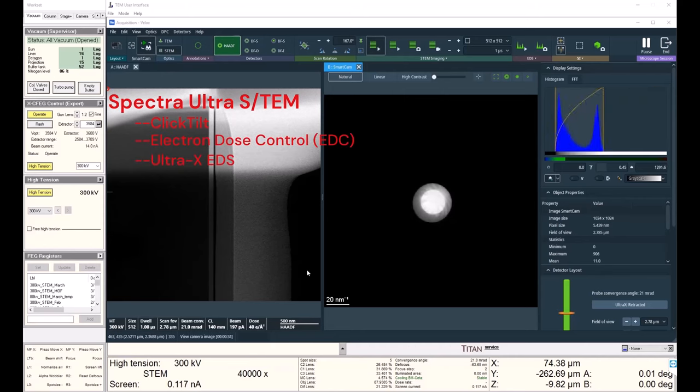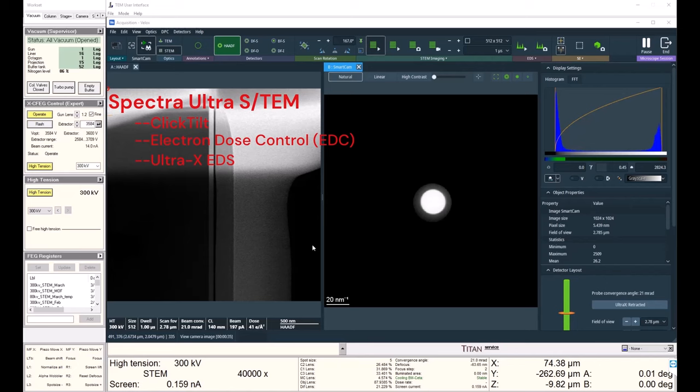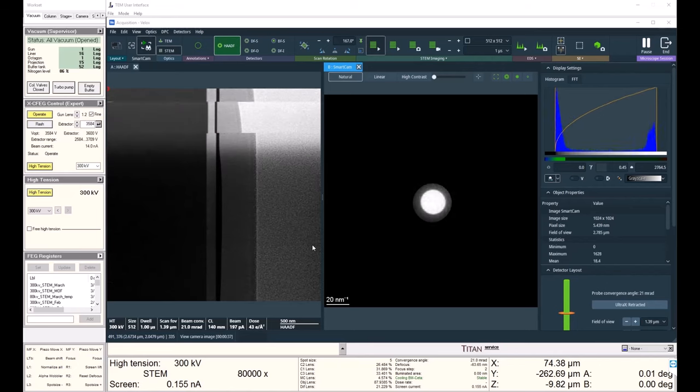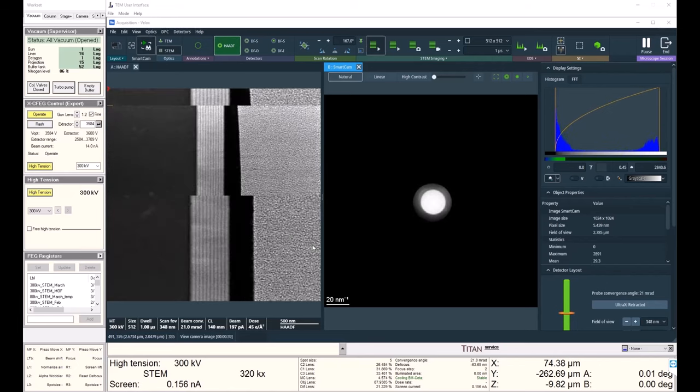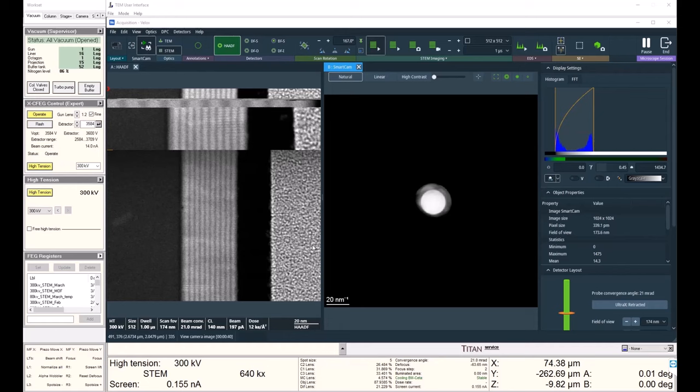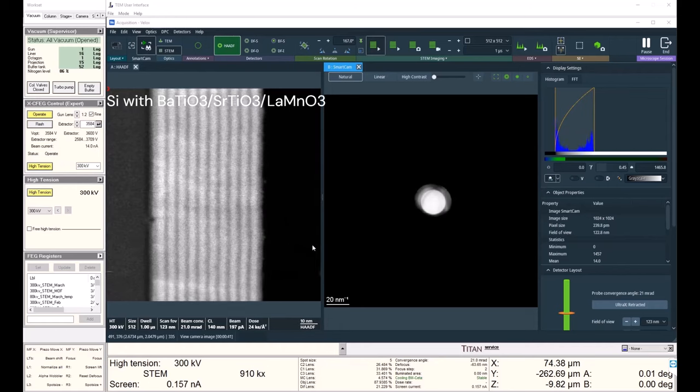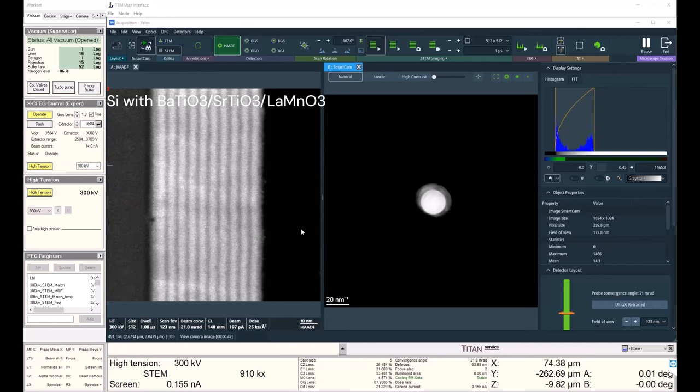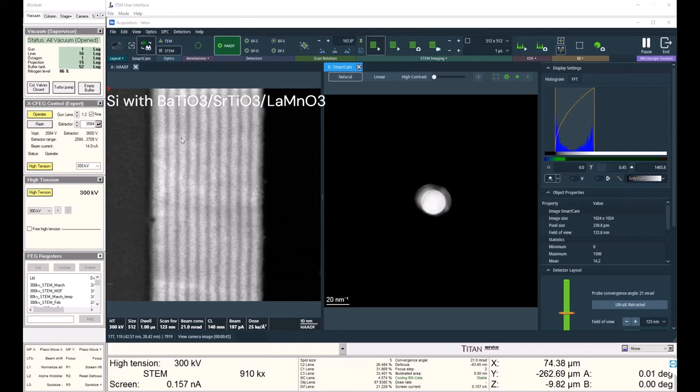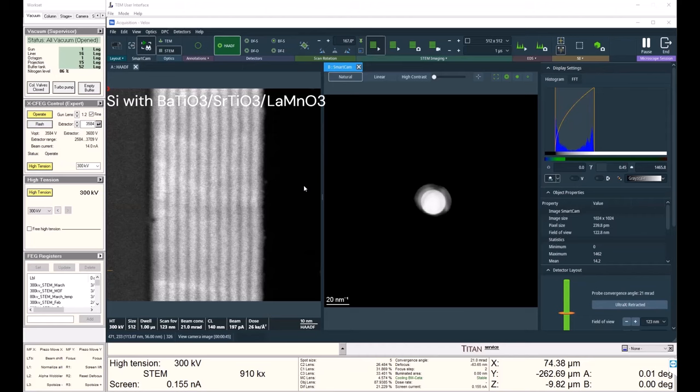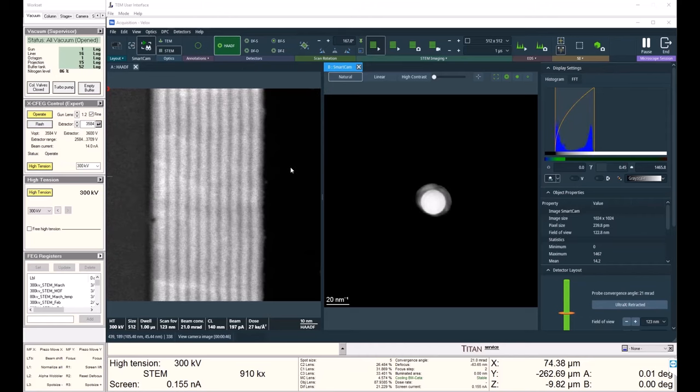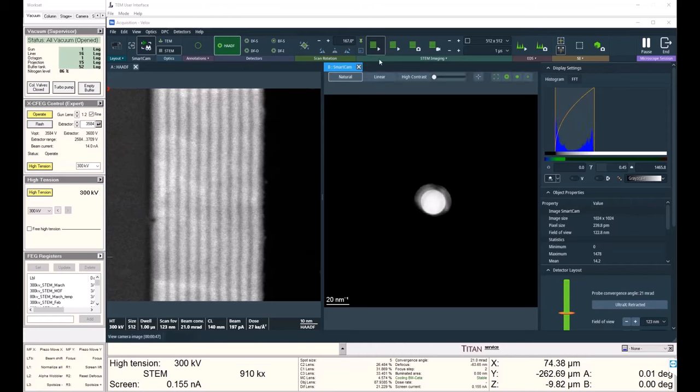I have a FIB lamella inserted with a silicon substrate that has these beautiful layers grown on top of it of strontium titanate, lanthanum manganate, and barium titanate. I can see my layers already, but I can also see I'm not quite on the zone axis.